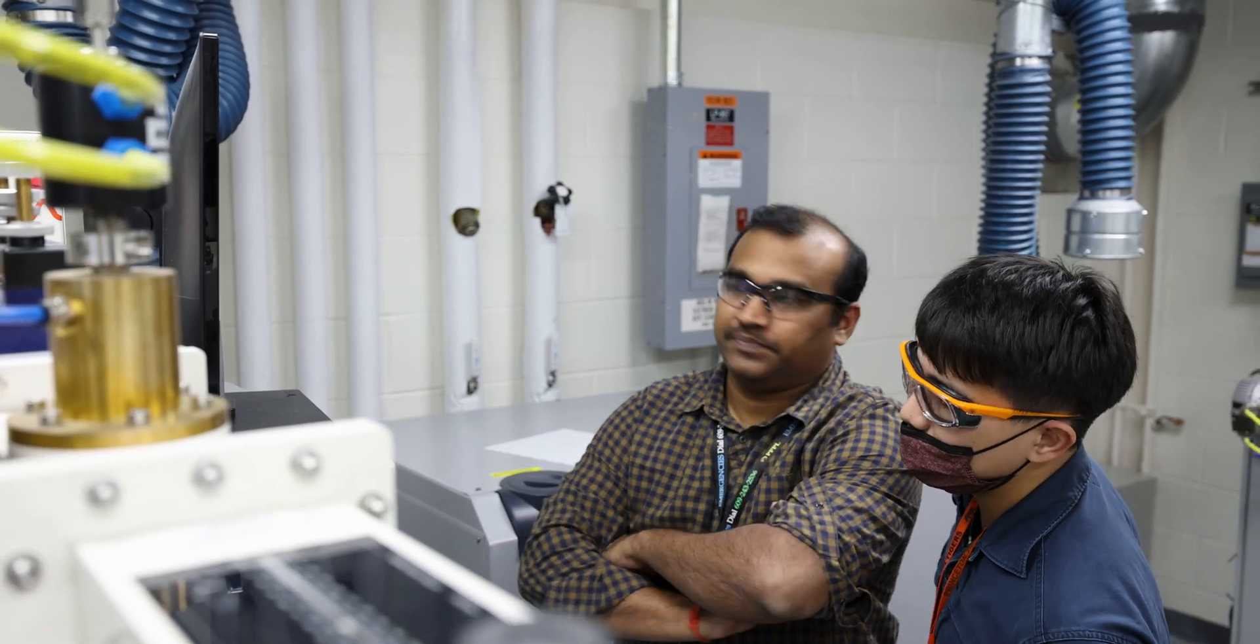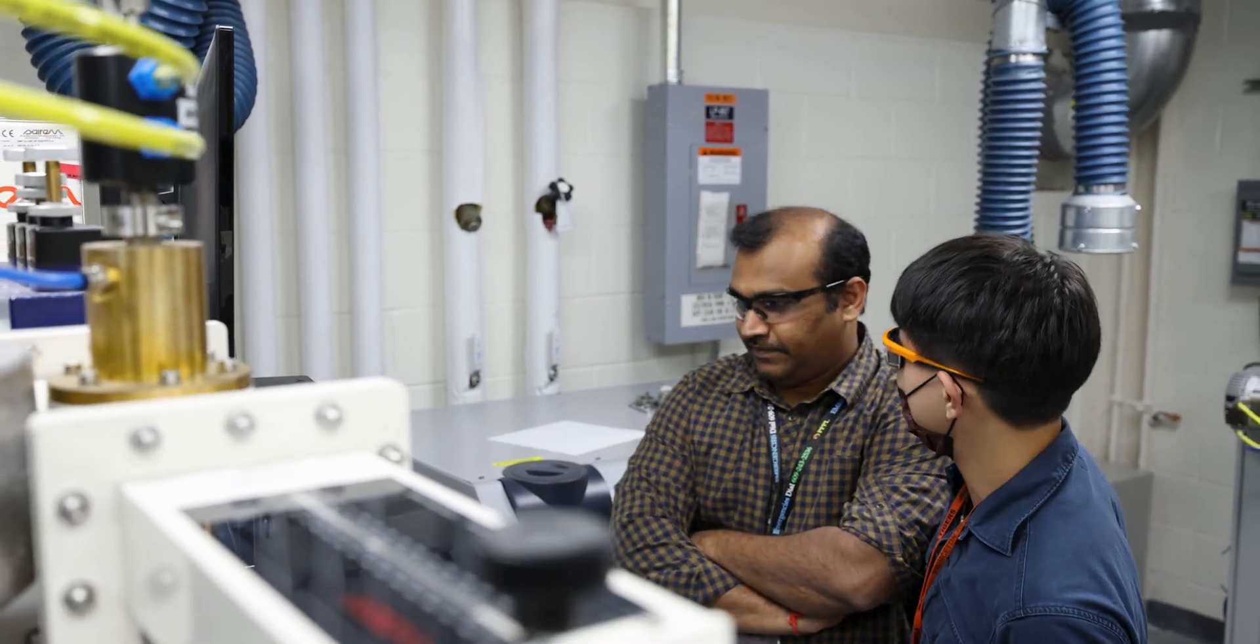We've got two diamond growing machines here. They're actually both the same machine, but we're using them for two different purposes. One machine uses extremely high purity carbon and hydrogen to grow extremely high purity diamond. The higher the purity, the better it is for certain quantum and microelectronics applications.